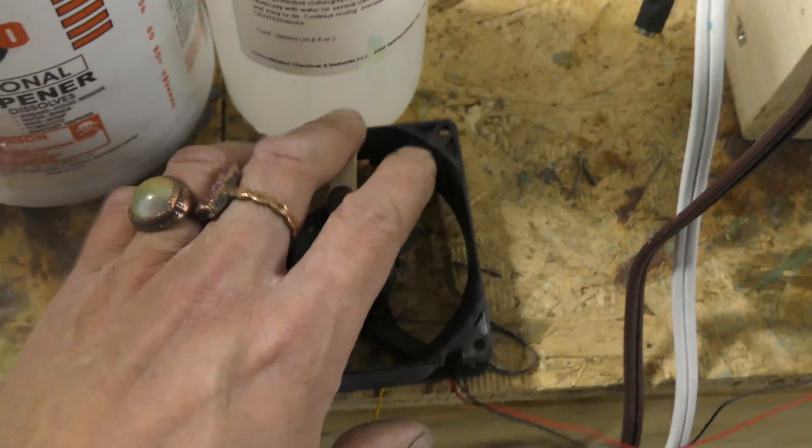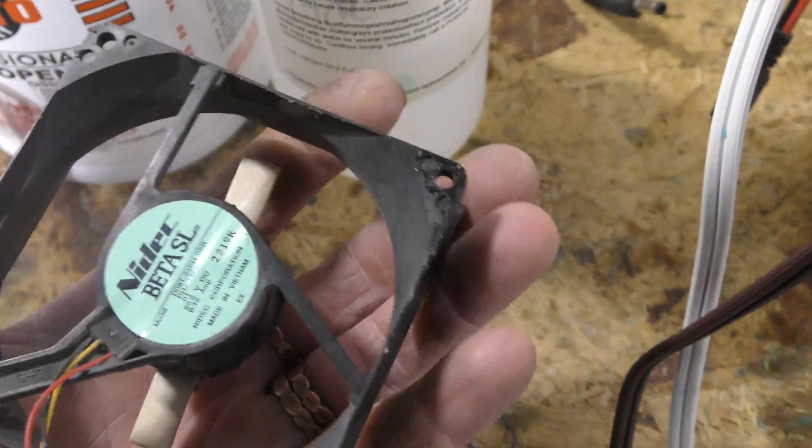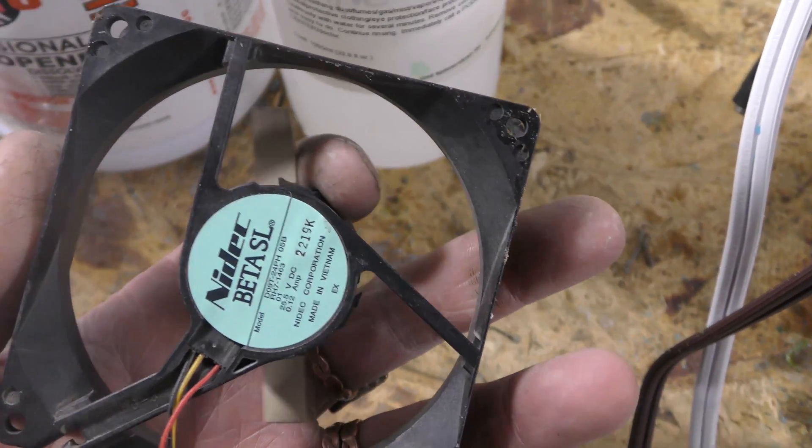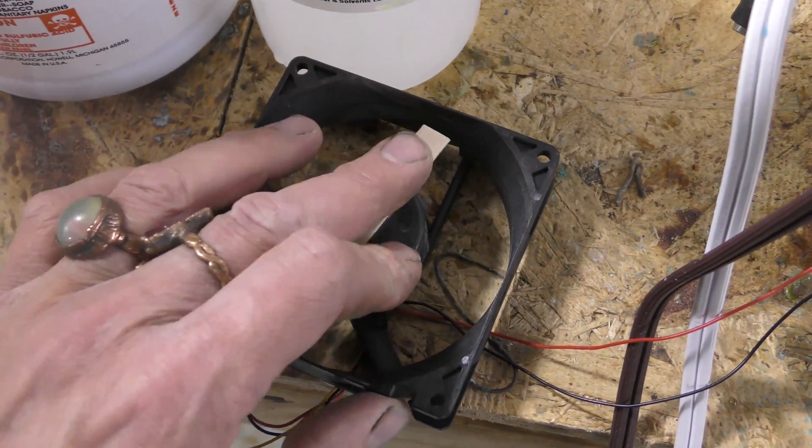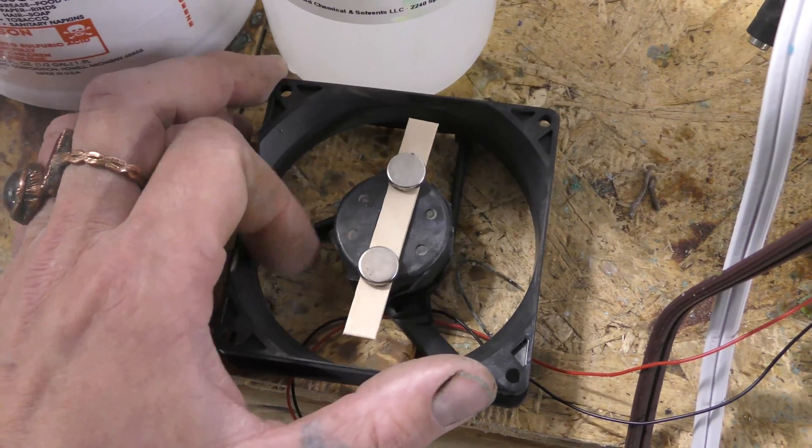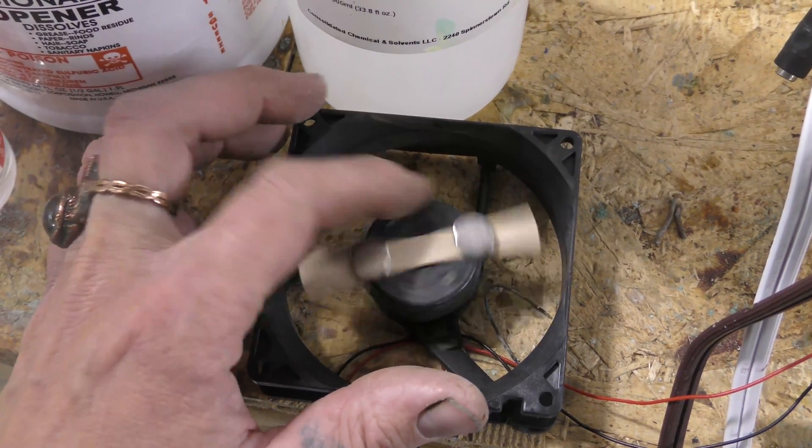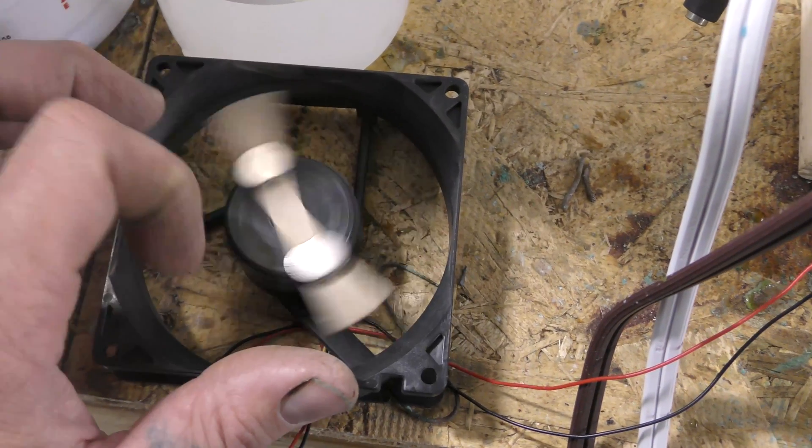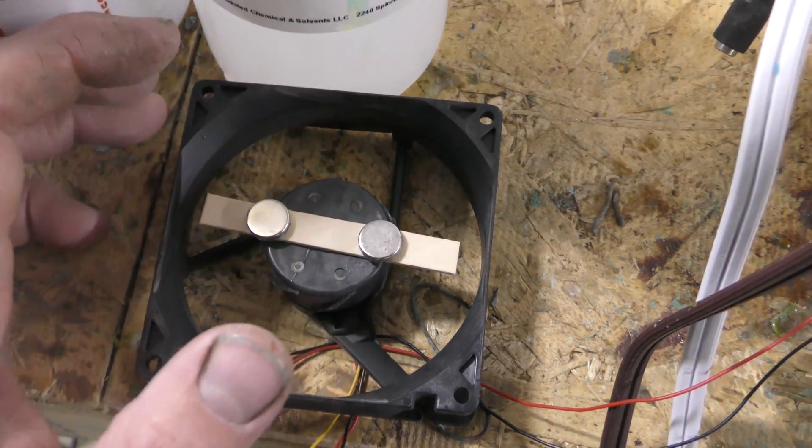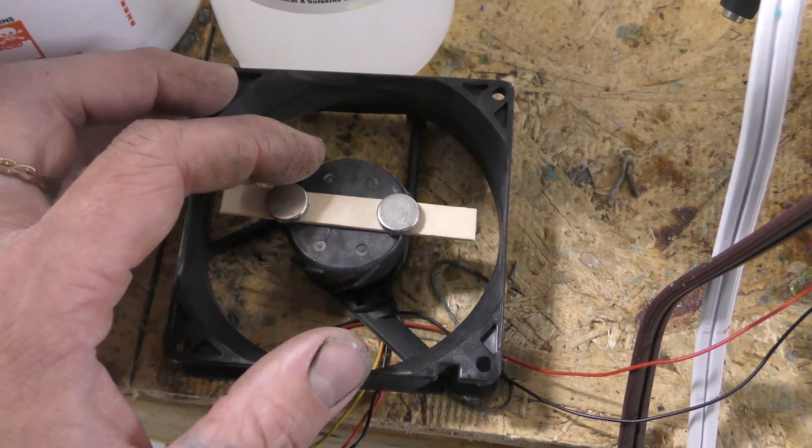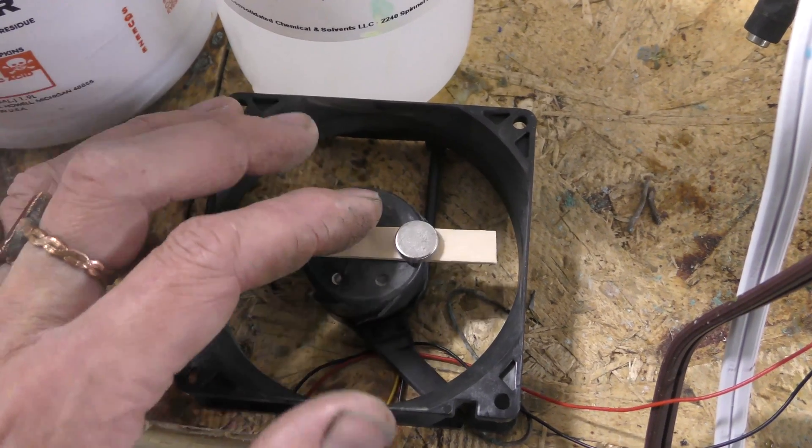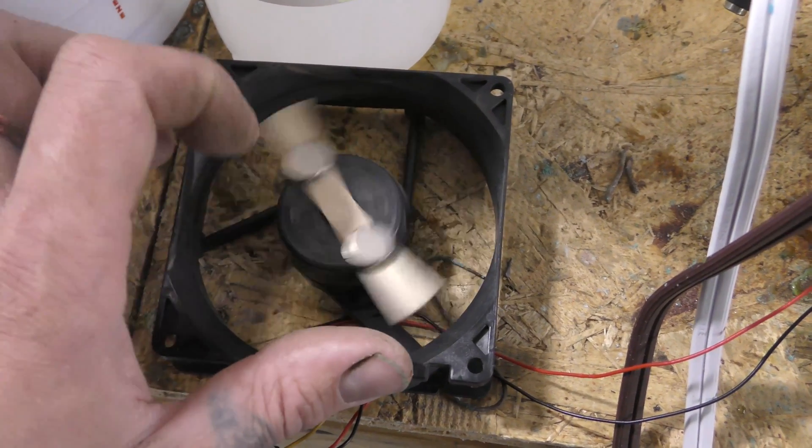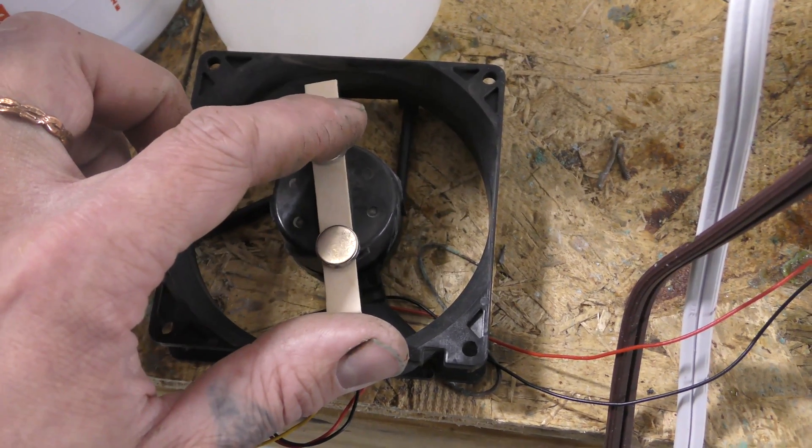Now obviously I wouldn't want to put 24 volt 4 amps because it would burn the fan. But again, it's at 24 volt. So 15 volt 4 amps is powering it pretty well. You can get these fans on eBay for like, you can get a whole bunch of them for like 20 bucks. Or you can buy new ones for like 16 dollars. Would I go this route again? It was fun to build. But I don't know if I would do it because in the long run I have to have this thing running a long time. And these things are being pushed to their maximum power by trying to go through the viscosity of the fluid with a magnet. So it slows these down and creates quite a bit of work on the actual fan itself.